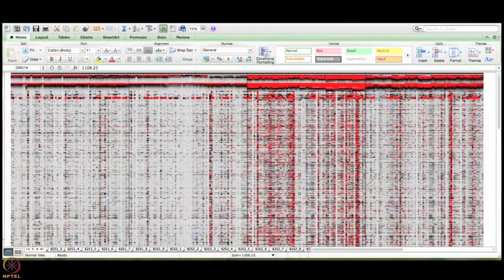So you can see in this slide here, basically what I have done is I have just minimized this Excel a little bit, so you will be able to see all 4 batches at once. I do not know if you can see a black line here. Basically this is going to split your set 1 from set 2 of the first batch and set 1 from set 2 of the second batch. So basically this is batch 1 set 1, batch 1 set 2, batch 2 set 1 and batch 2 set 2.